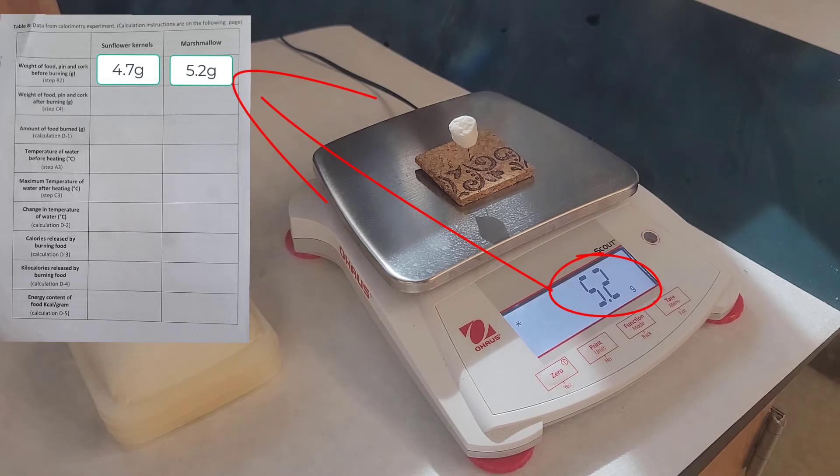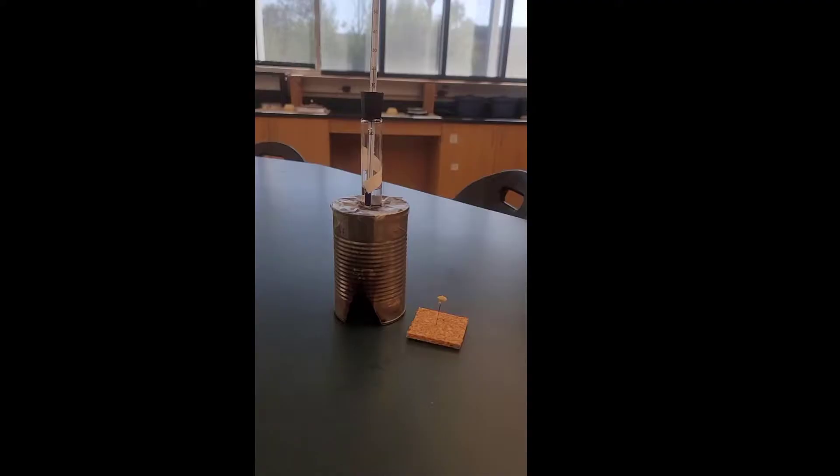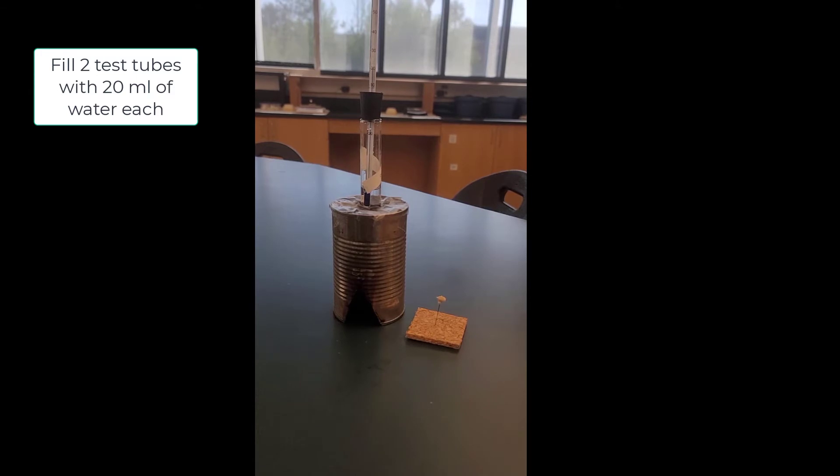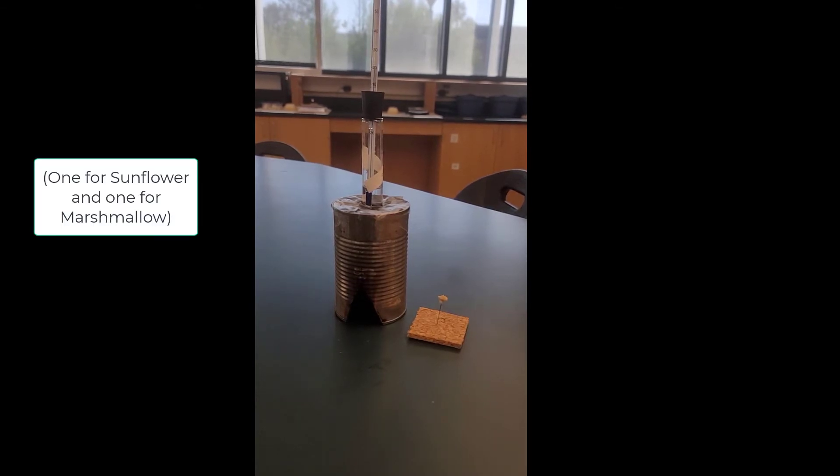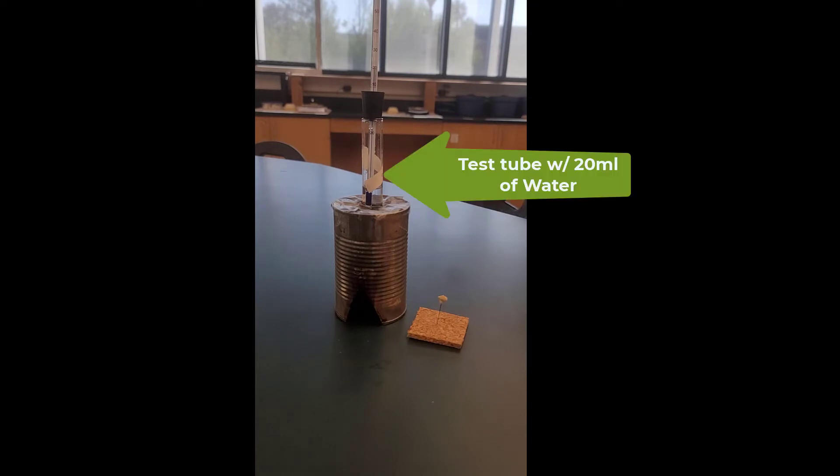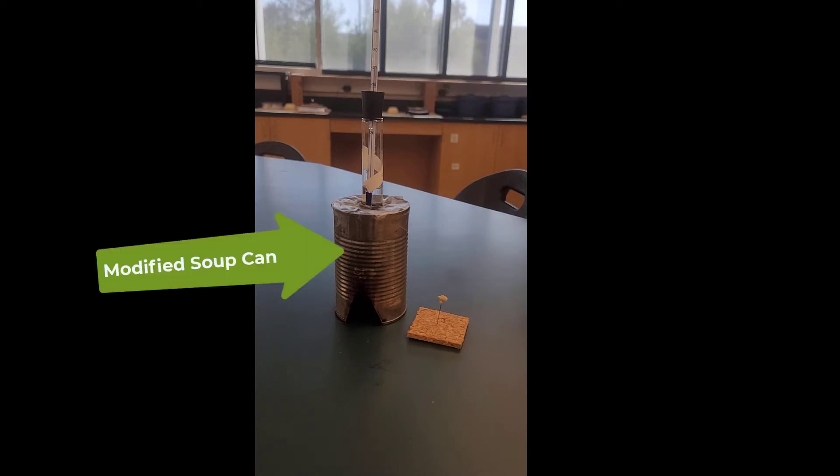Now what we're going to do is get two test tubes with 20 milliliters of water. Then you're going to take your rubber stopper that has a thermometer inserted through it and put that on top of your test tube. Then you're going to place that test tube inside the metal can that you have at your desk.